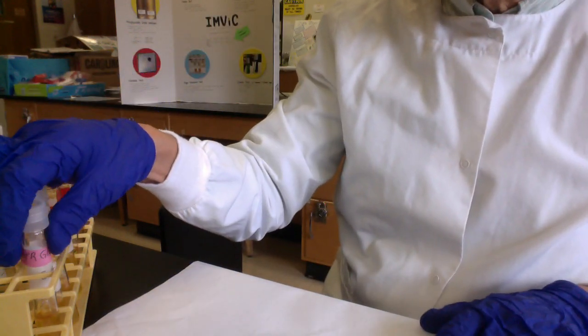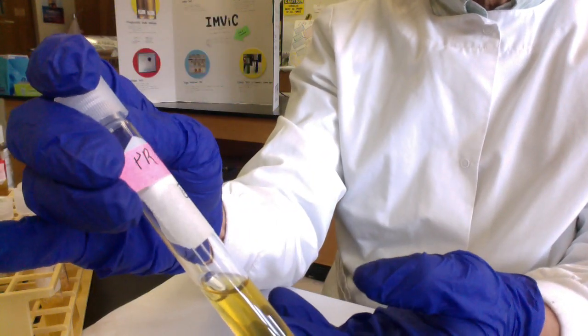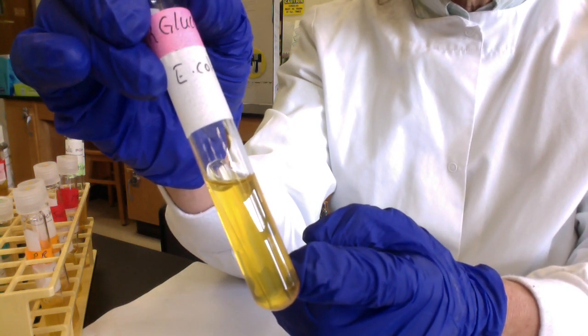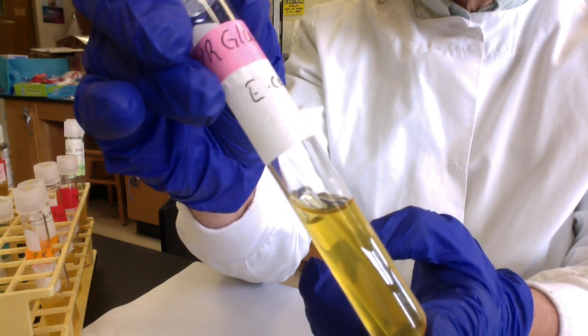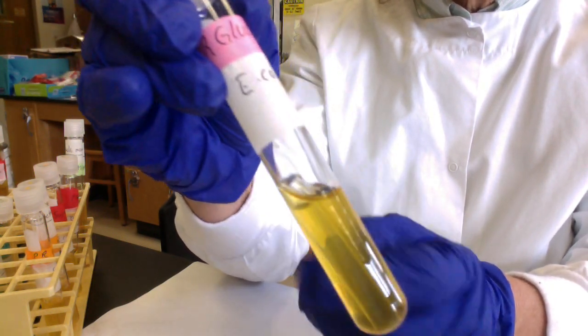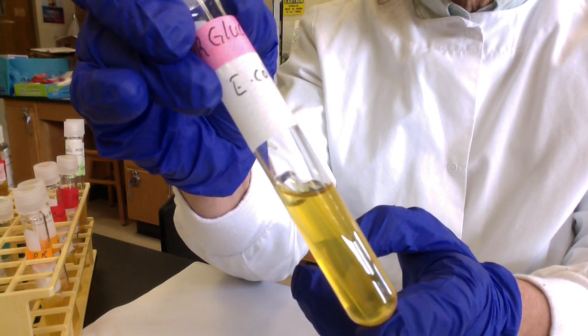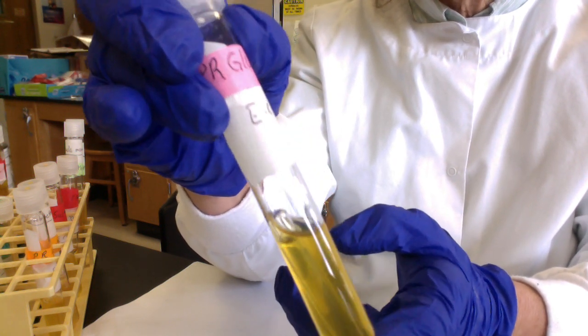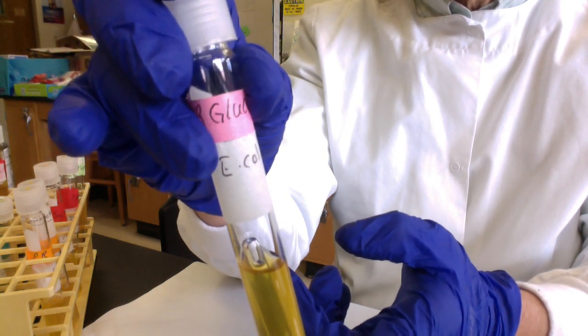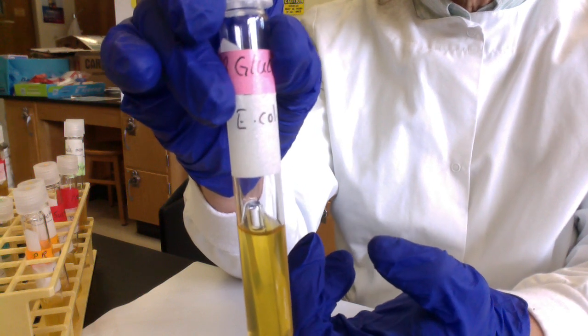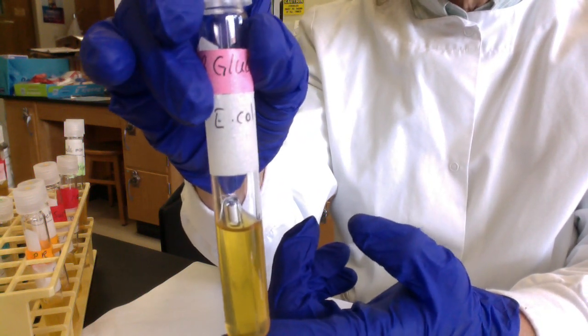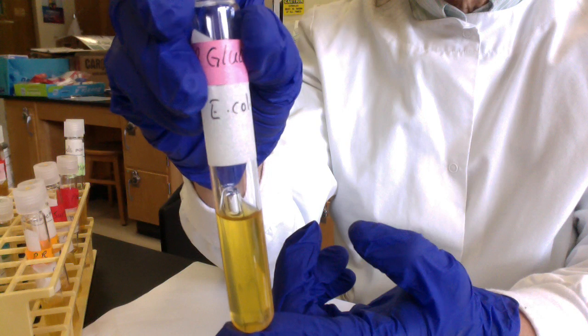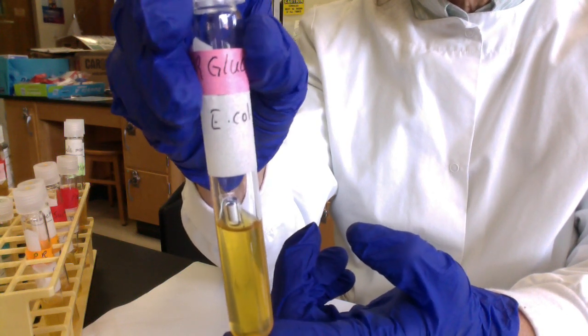Here is E. coli in glucose. The medium is yellow, so it fermented the glucose and made acids, turning the phenol red yellow. I can see a gas bubble in the top of the Durham tube, which tells me E. coli produced gas during fermentation—either molecular hydrogen, carbon dioxide, or both. We have a scoring system: if it's acid, we use A. Then we do a slash and put a plus sign if there's gas, negative if there's no gas. This would be A/+: acid and gas from glucose fermentation.